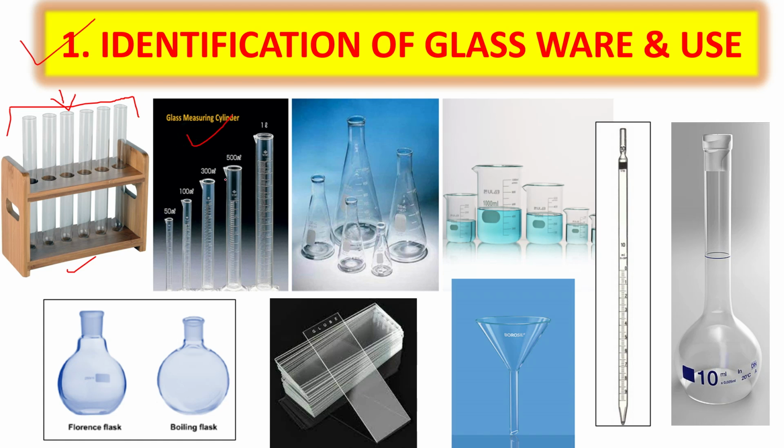Next is the measuring cylinder. What is the use of the measuring cylinder? We have to say that it is used to measure a particular volume of solution or water. Next is the conical flask. Where can we use it? The conical flask is used for mixing different types of solutions, reagents, or media, and you can also use a conical flask for autoclaving.